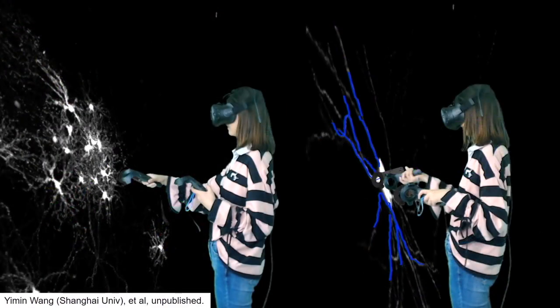The second technology I want to mention is the VR technology, also described by Yun before. When the annotator wears the VR equipment, they can immediately visualize the entire mouse brain at the global scale, and you can zoom all the way in to the highest resolution to see the single neuron level. You can rotate the image and do the annotation. In the virtual space, the image is clearer and you can do the annotation more precisely.